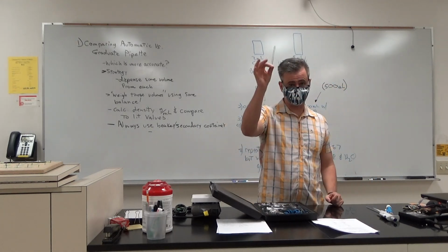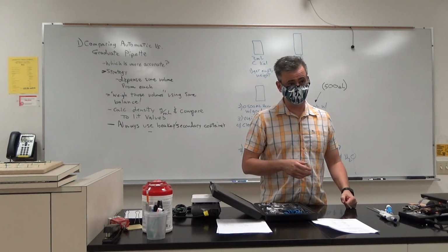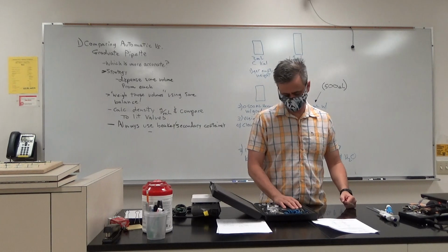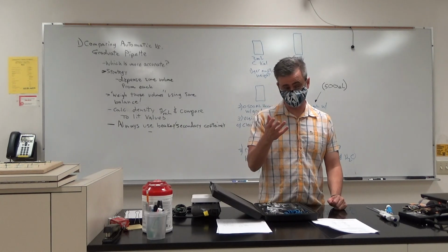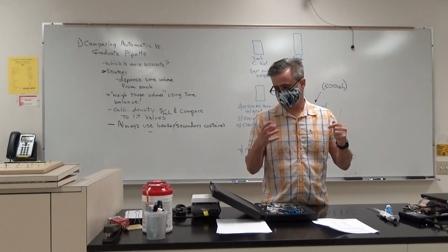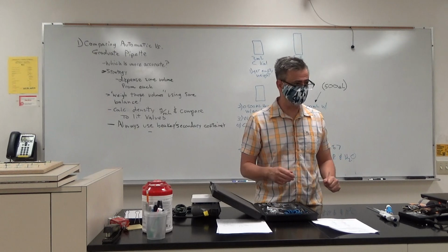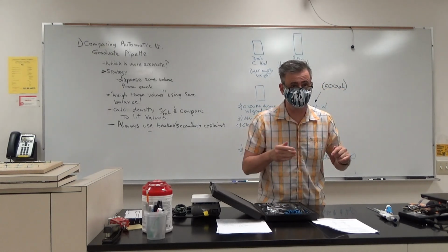But these are disposable pipettes. There are going to be a lot of times, like in this lab, when we're rinsing off our aspirin after we synthesize it, it says put in 3 mil. There are a lot of times in organic chemistry, and you'll grow accustomed to knowing when you don't need to sit there with a graduated cylinder looking at a meniscus to get 3 mils.